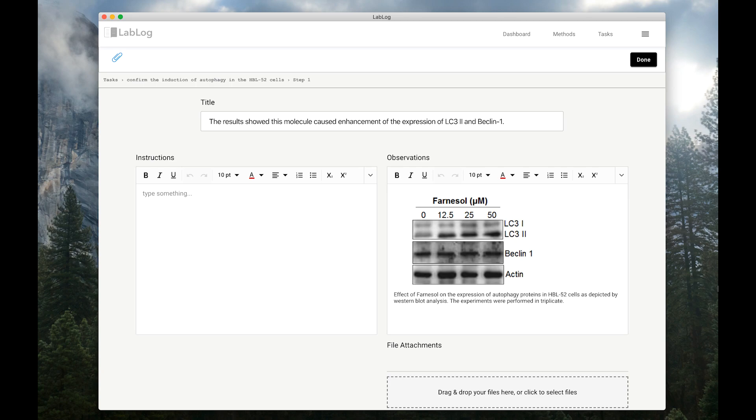It's not just about recording experiments though. You can share notes, schedule reminders, work with PDF files, images, and spreadsheets.